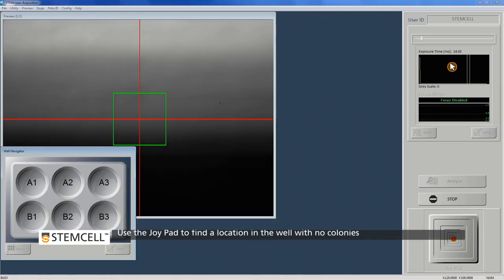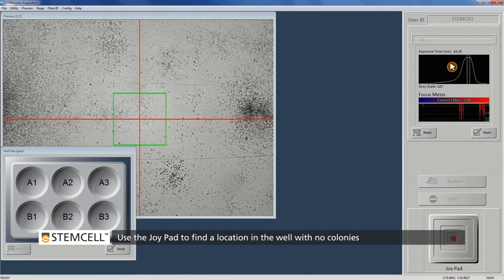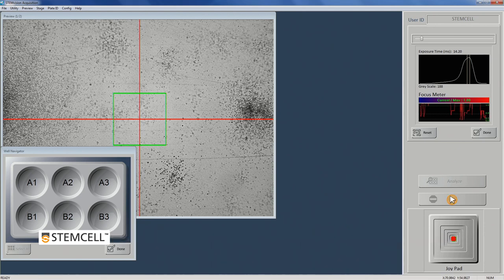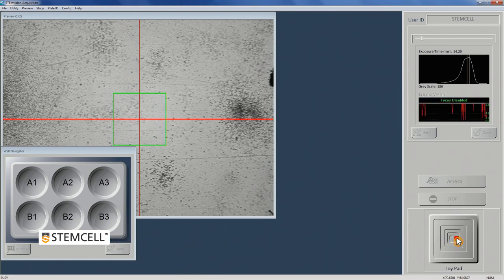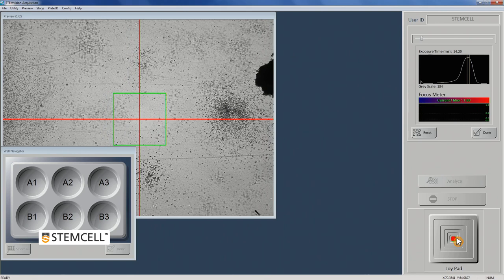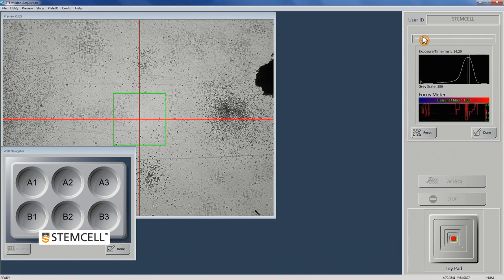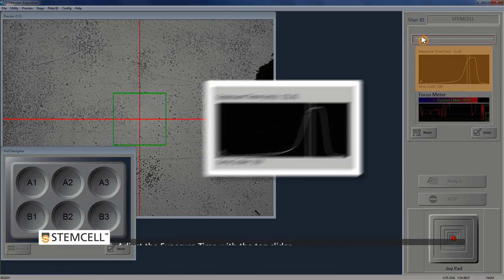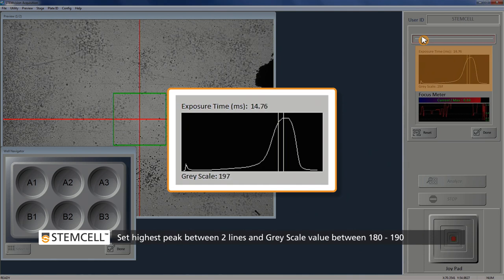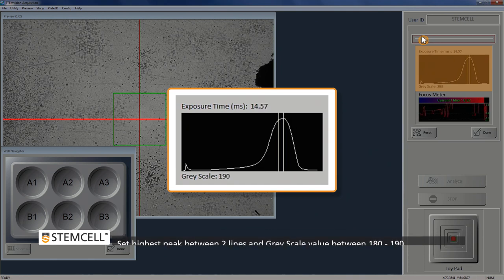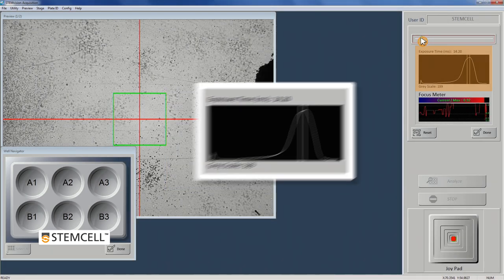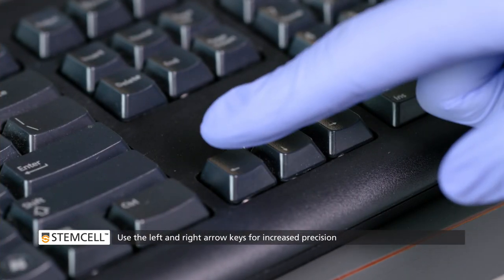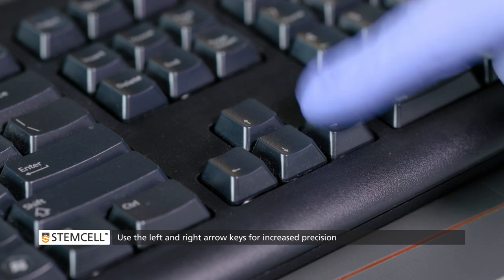Find a location in the well that has few to no colonies or cells. Click and drag the red dot of the joypad to move the microscope stage to a clear area. It is important to find an area with as few colonies as possible. Use the top slider bar to adjust the exposure time so that the highest peak falls between the two vertical lines and the grayscale value reads between 180 and 190. Use the left and right arrow keys on your keyboard for increased precision.